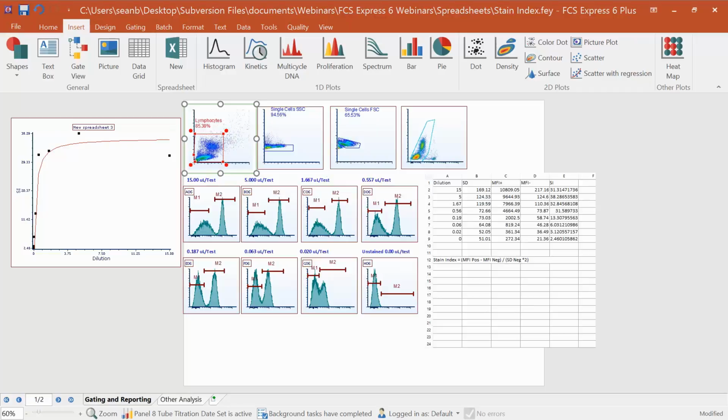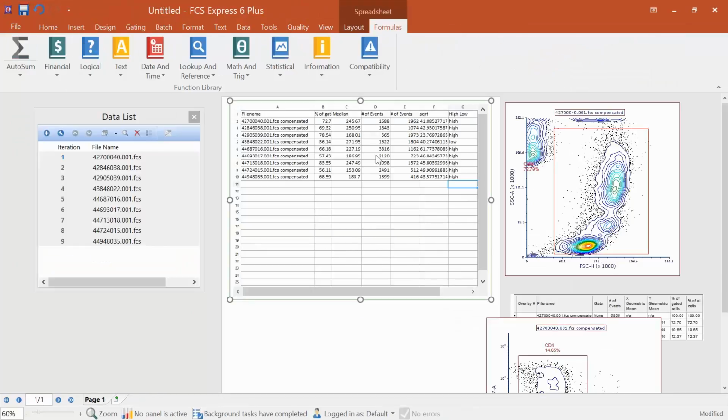So again, I did want to reiterate, now that we're looking at formulas in the software, that these behave just like Microsoft Excel. They're inserted just like Microsoft Excel. They update in real time. And very importantly, if you saw we're working with custom value if-then statements, you might remember that looked really cool in the webinar, but you can't remember how to create that logical function.